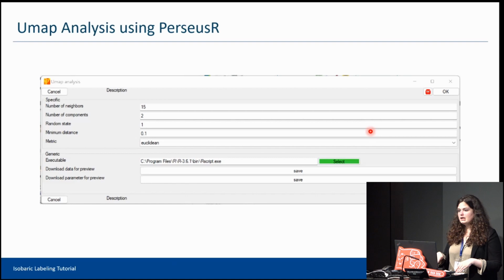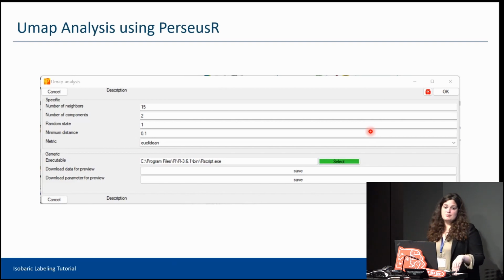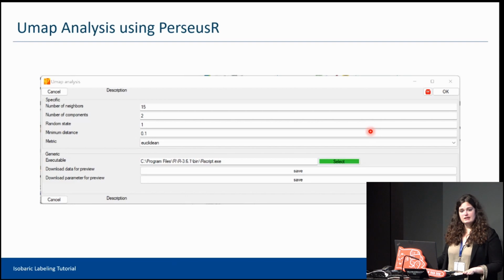If you go in the Cox Lab repository, the Perseus plugin, there are some of them already done in pure C#, and you can do it like that. But another example is, look, I don't want to develop entirely from scratch in C#.